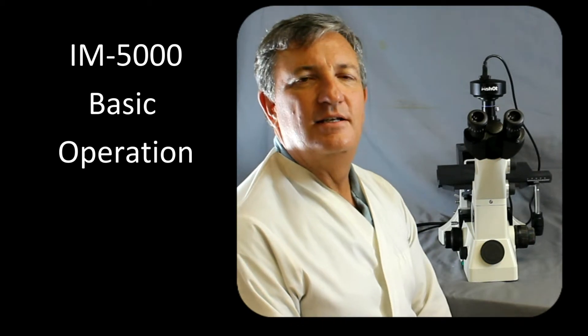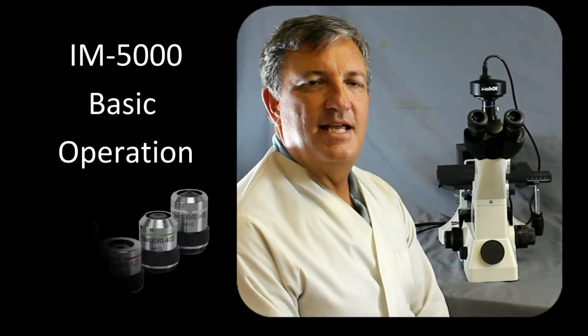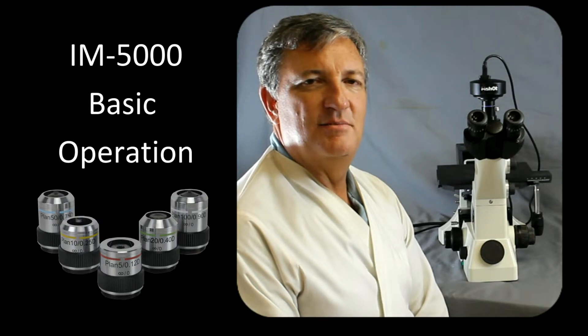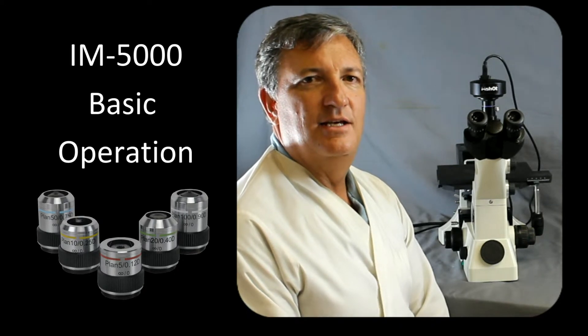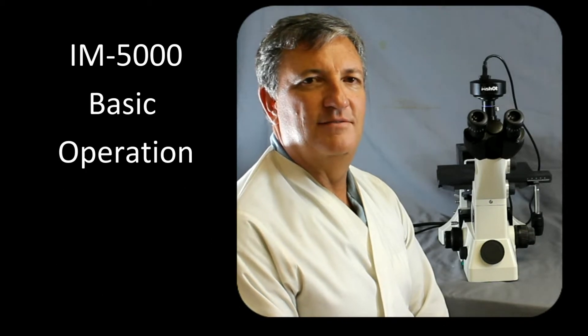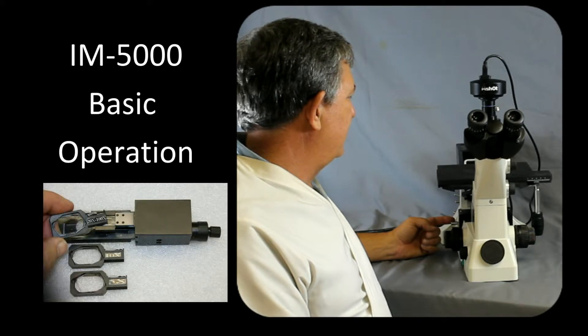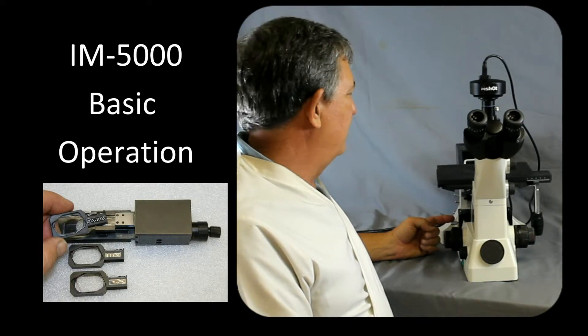The IM5000 uses both bright field and dark field objectives. The standard set of objectives that come with the system include a 5x, 10x, 20x, 50x, and 100x objective lenses. There's also differential interference contrast that can be added with the Nomarski prism.